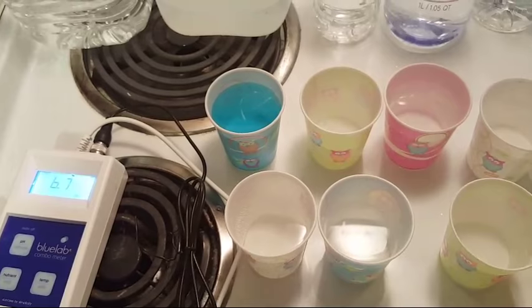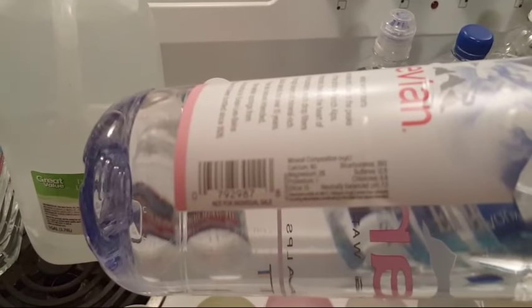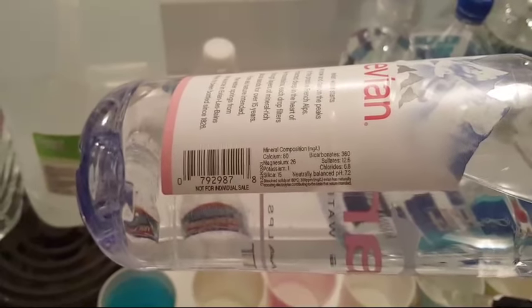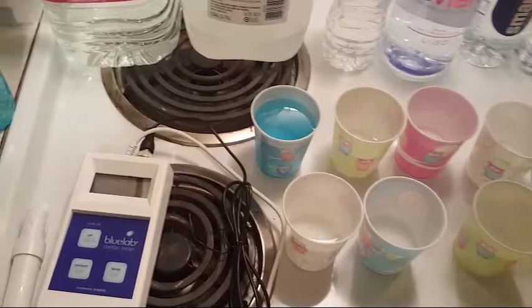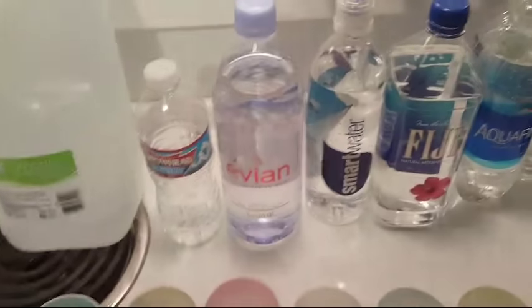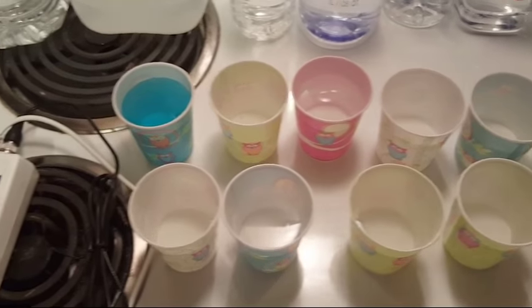Next up is Evian. Evian is a very expensive water, but also a really good water. Right on the label you can see it has calcium, magnesium, potassium, silica, sulfates, chlorides, and bicarbonates — a lot of good stuff. This also has the highest TDS, meaning the most PPMs out of all the waters I've tested, which means it's really good for you. It's setting at 7.1 — that's pretty much where it settles. A lot of people think Smart Water is really good for you, but as you're going to see, the pH is bad and it doesn't really have much in it — the TDS is kind of low too.